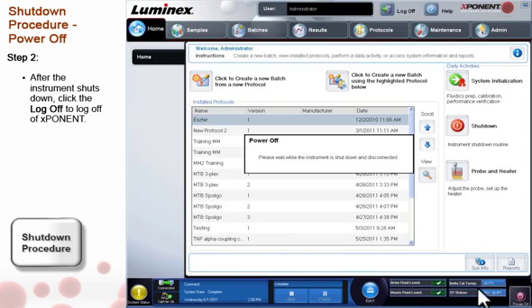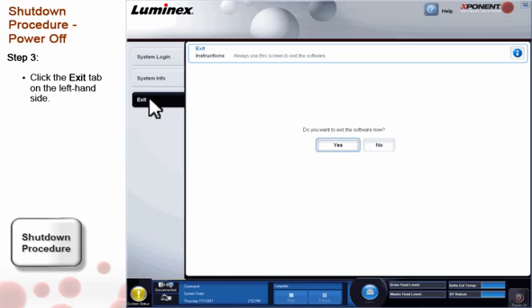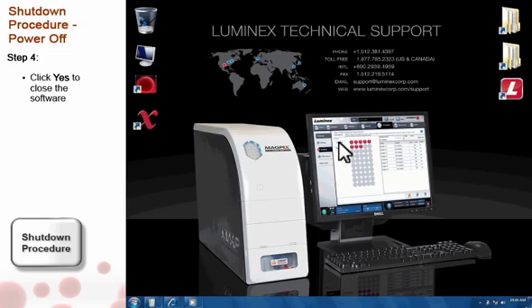Then, to close Exponent, click the Log Off button at the top of Exponent. Then click the Exit tab on the left-hand side of the software. A confirmation dialog box will appear. Click Yes. Exponent will close.